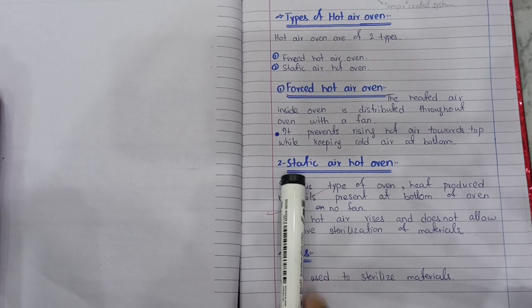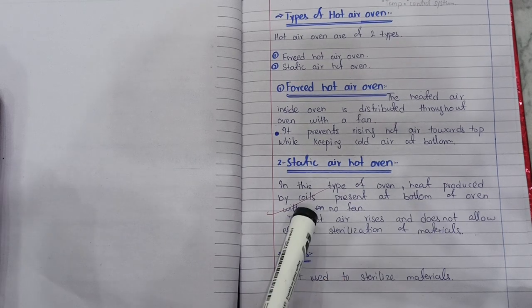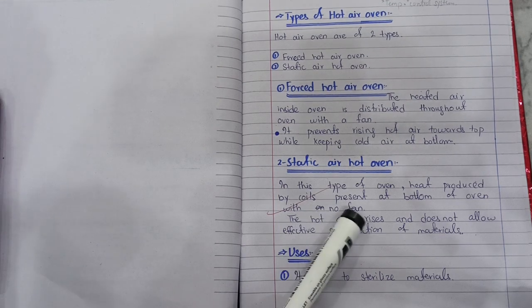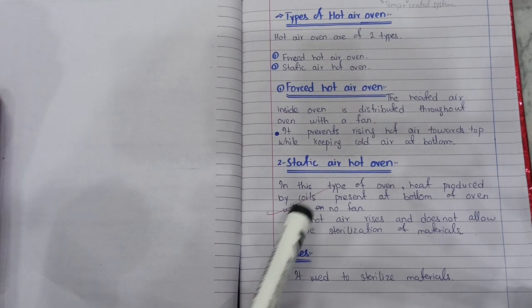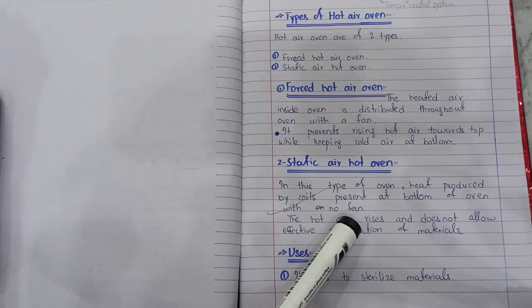जो दूसरी टाइप का ओवन है स्टैटिक एयर ओवन, इसके अंदर क्या होता है, it is a type of oven, heat produced by the coils. तो यहाँ पर जो हीट प्रोड्यूस होती है वो कॉइल्स से होती है. अब ये जो कॉइल्स होते हैं ये प्रेजेंट होते हैं at the bottom और फ़ैन नहीं होता है इस ओवन के अंदर.